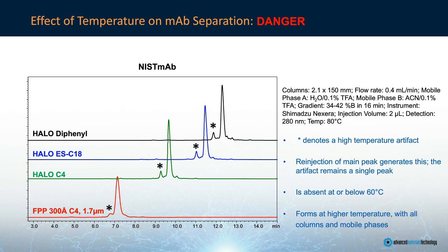So, a word of caution: artifacts like these may be observed, and it's unknown what it is. We have not characterized it, but it is curious and also a word of caution. Selecting temperature may be very important for the separations that you're pursuing.